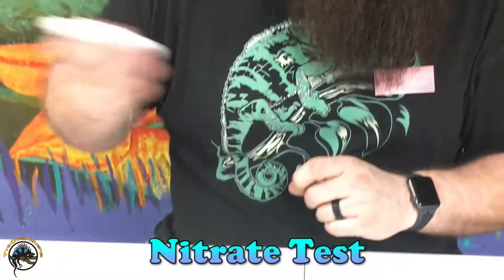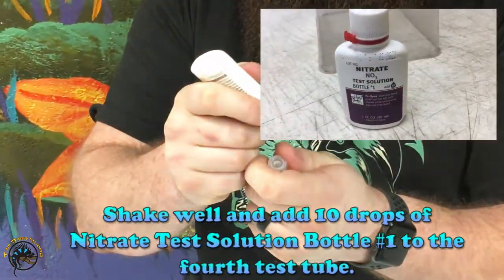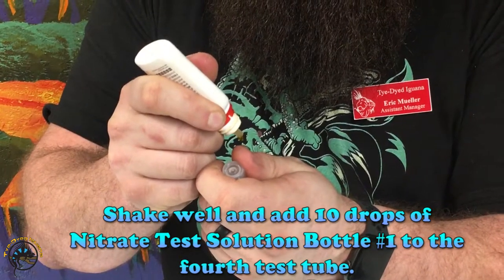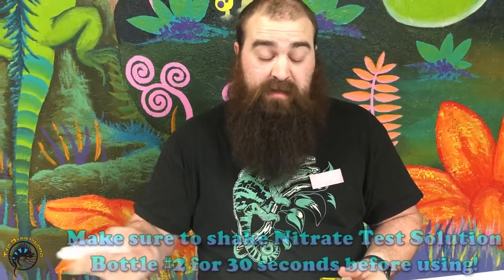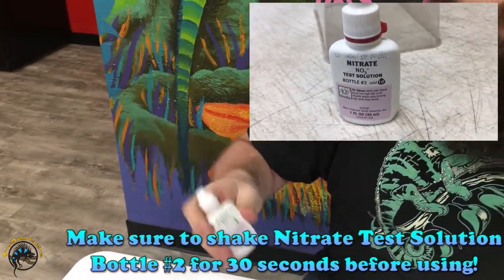With the nitrate test kit, the first bottle you can just shake a little bit and add that in. Where it becomes tricky is with the second bottle — a lot of people tend to forget this. This bottle actually needs to be shaken for 30 seconds by itself. The nitrate bottle two needs to be shaken for 30 seconds to mix it all up.